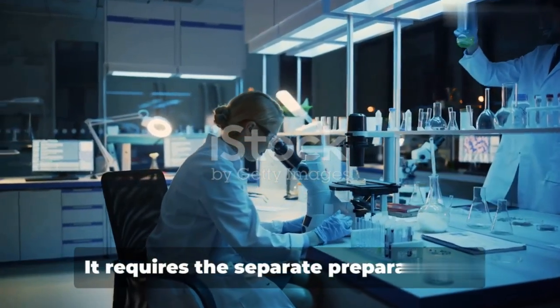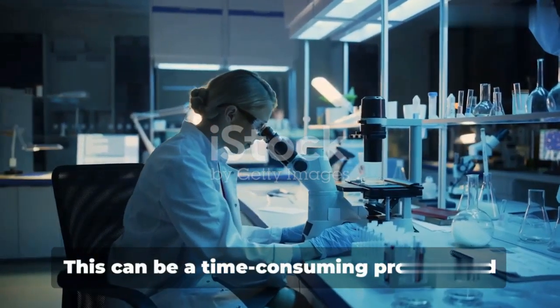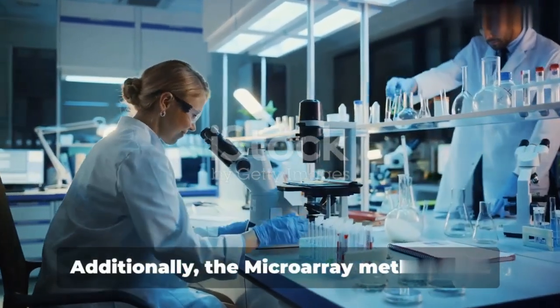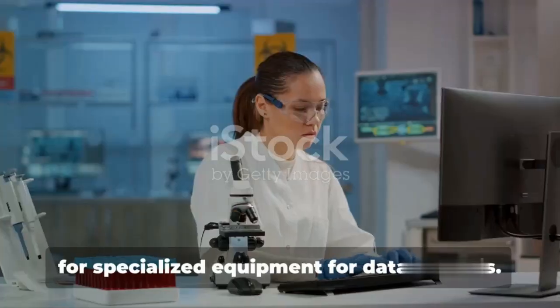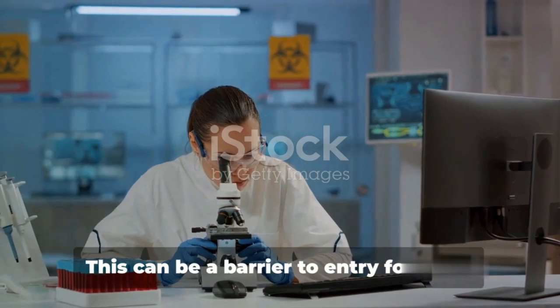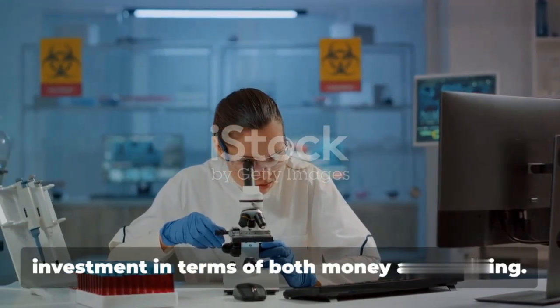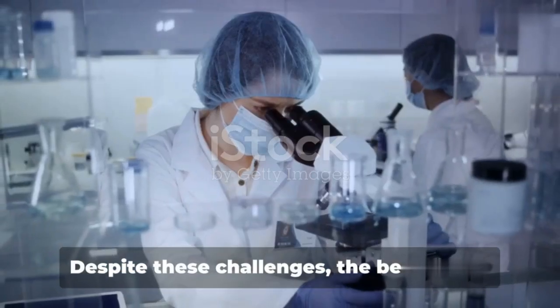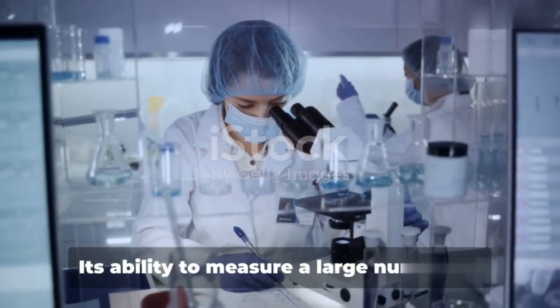It requires the separate preparation of control and test samples. This can be a time-consuming process and may introduce variability into your results. Additionally, the microarray method calls for specialized equipment for data analysis. This can be a barrier to entry for some researchers, as it requires a significant investment in terms of both money and training. Despite these challenges, the benefits of the microarray method are undeniable.